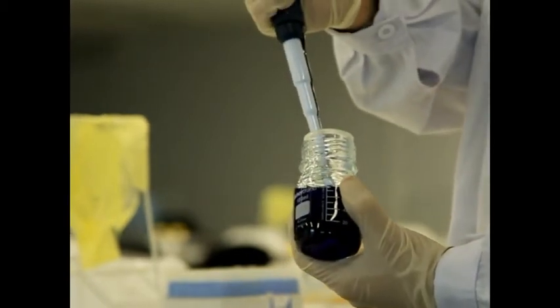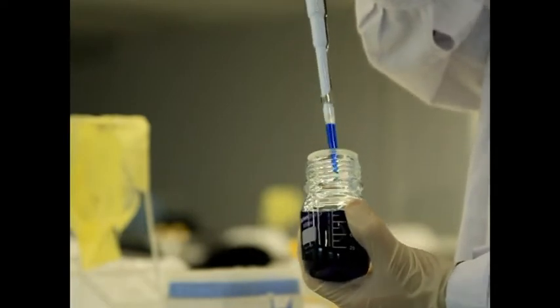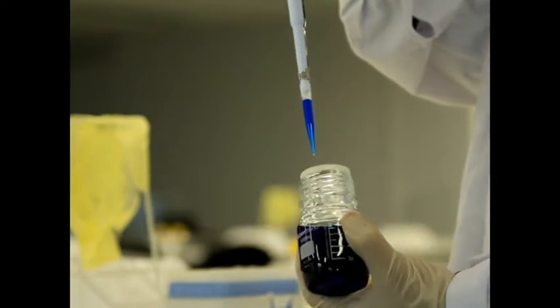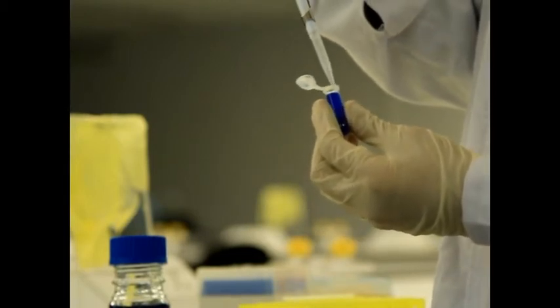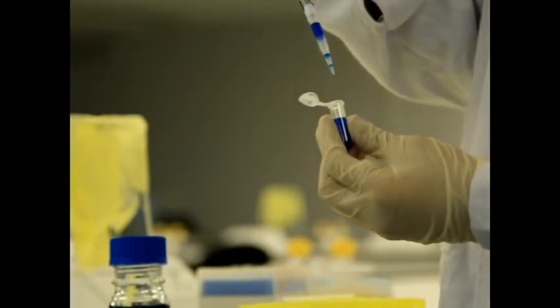Notice the position of the pipette tip as it is immersed in the sample. If it is too deep, it may form extra droplets outside the tip, and they will be deposited along with your calibrated sample. If the tip is not deep enough, then vortexing will occur in the liquid, and your pipette will suck up some air instead of the selected volume.